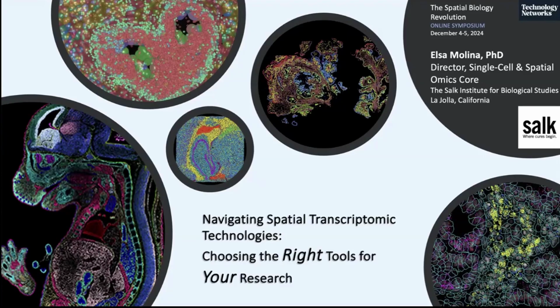So we are going to first review what technologies we offer and run here at the core at Salk. Then we will review the current technologies on the market. We will review what are the main differences between those technologies, and we will end by a homemade technology comparison table that I hope will be very helpful for you and your research.